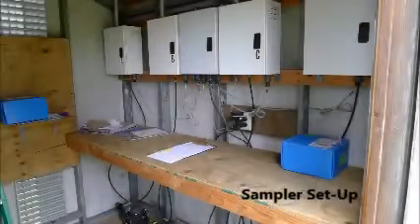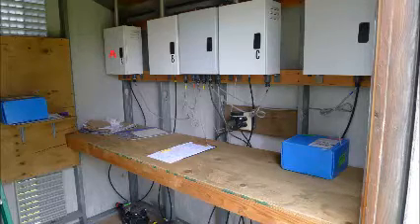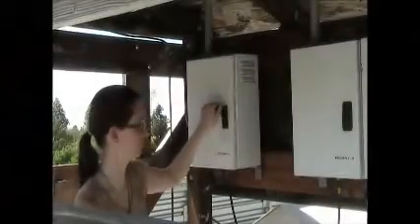Typically, there are 4 air sampling modules and 1 controller at each site. The modules are named A, B, C, and D. Each module is associated with a color. The A module is marked with red tape.